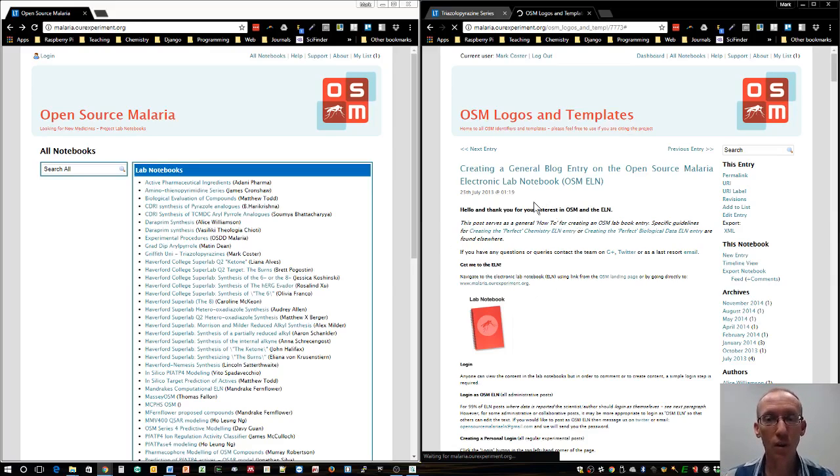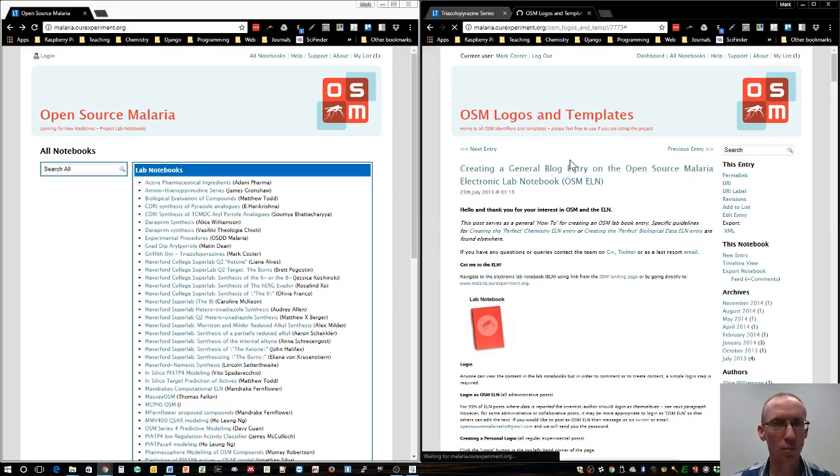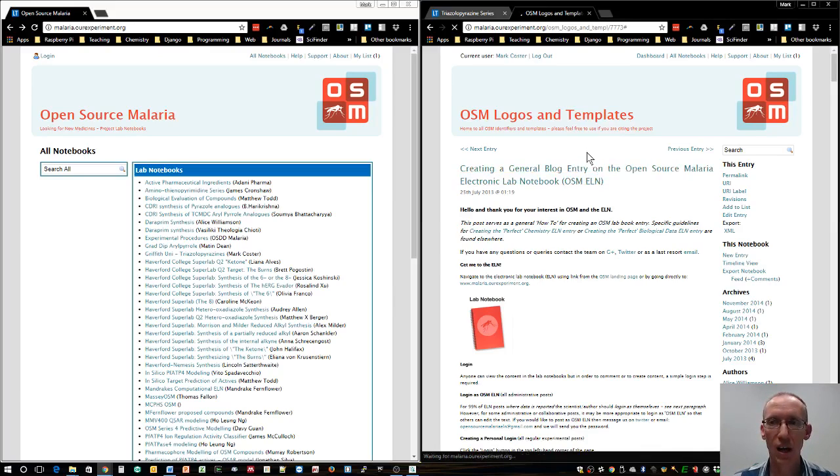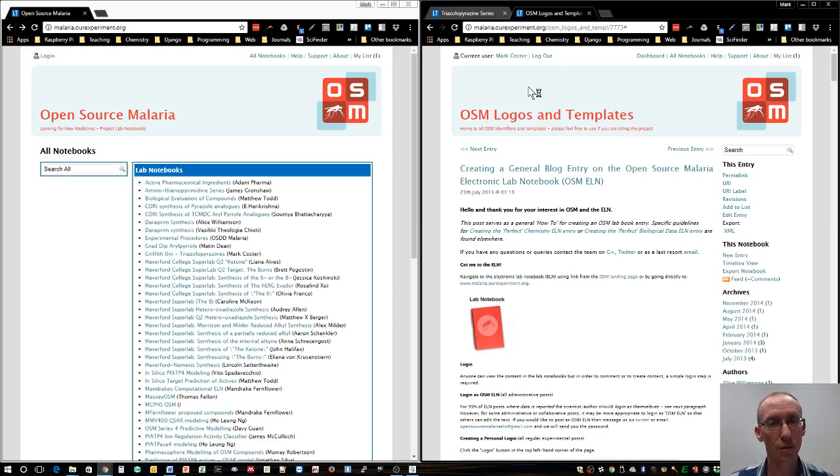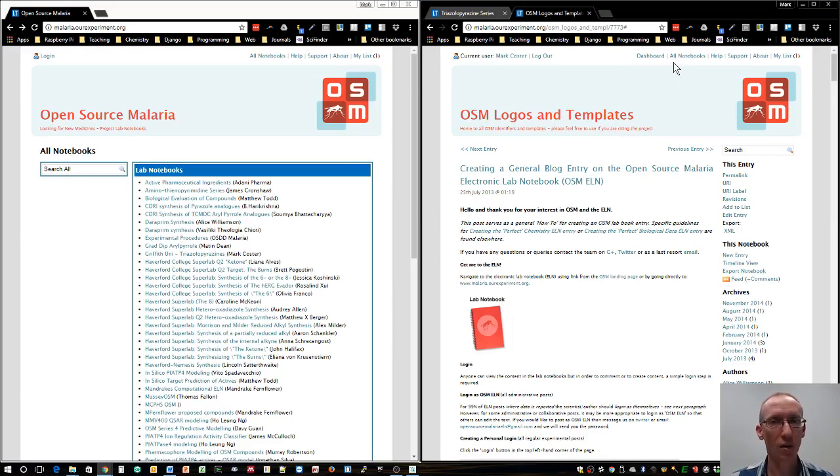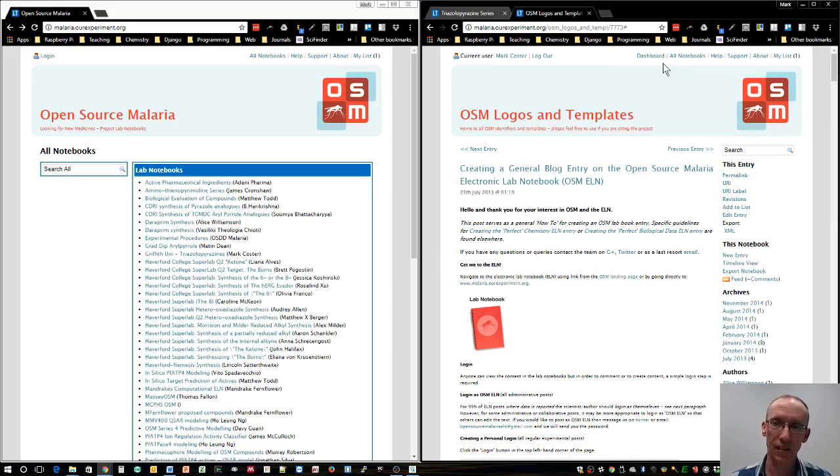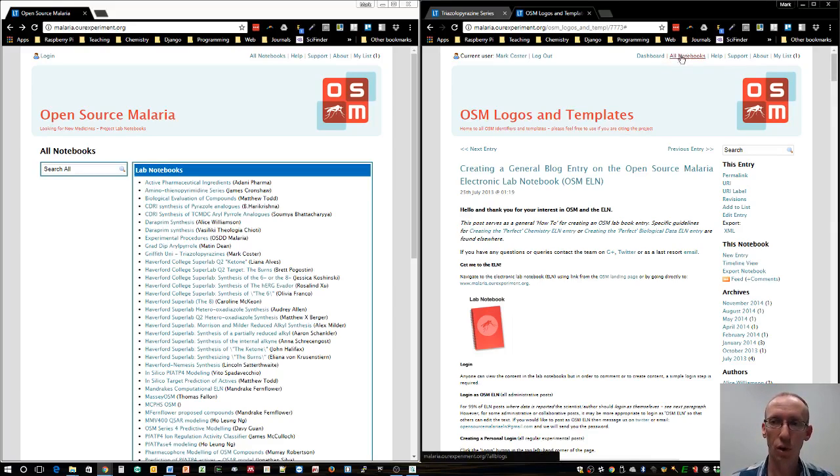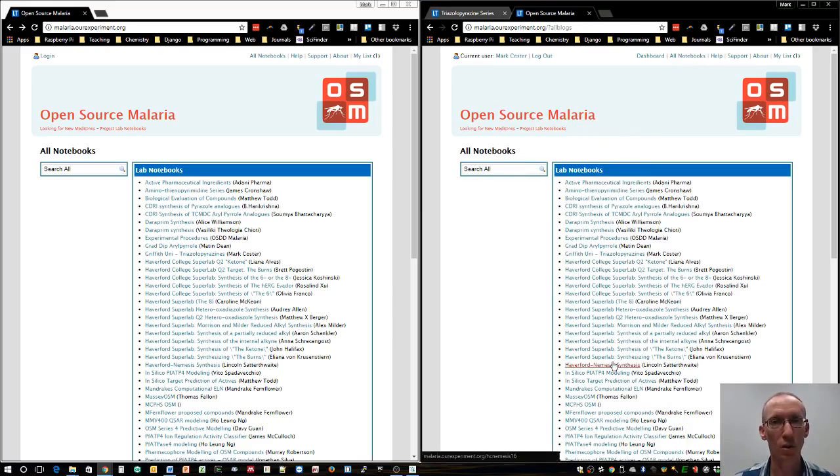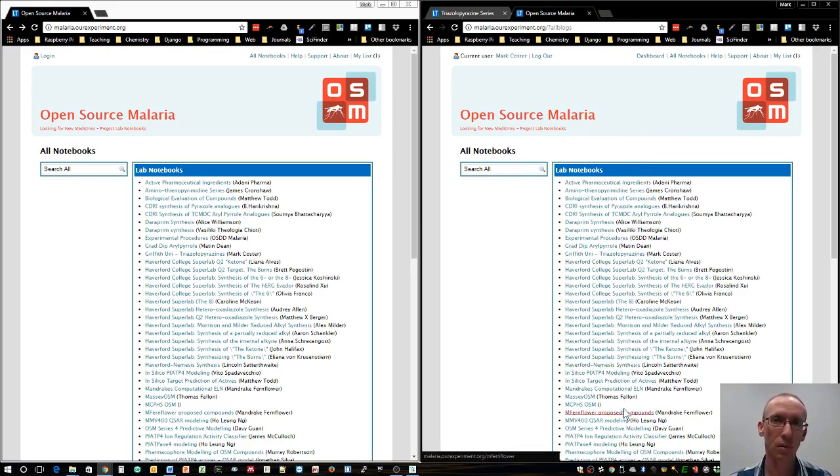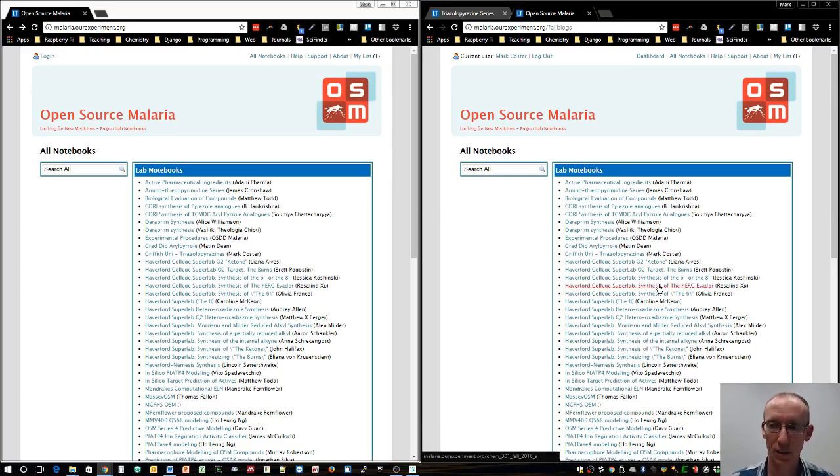Once you've set up an account and logged in, you don't have to set up a new notebook. If you're working with my group on this open source malaria project, we're going to use one notebook and each student will enter their own entries under their own account.